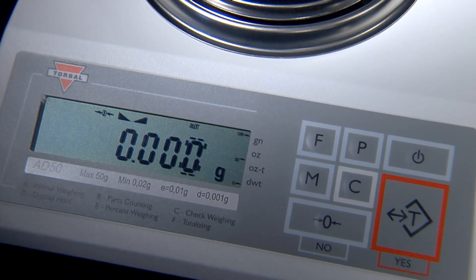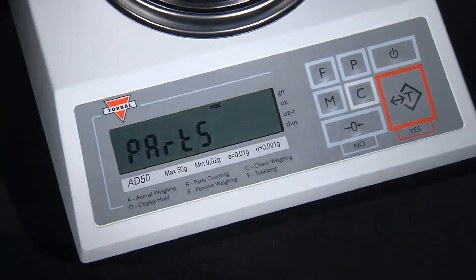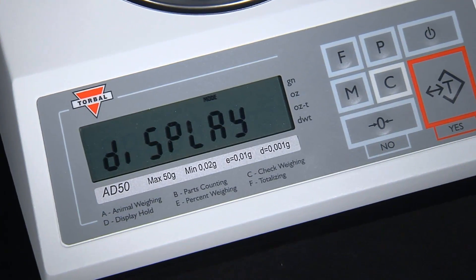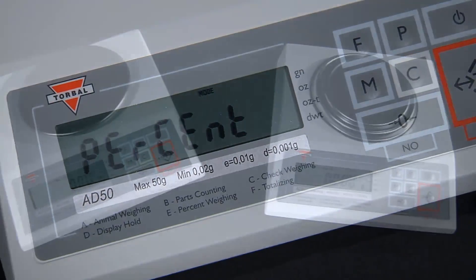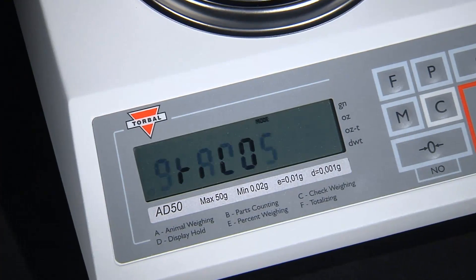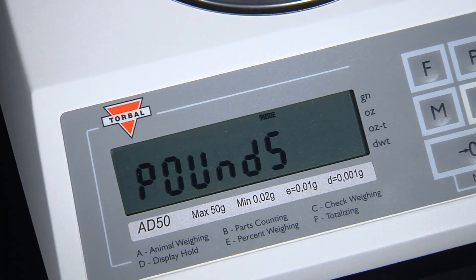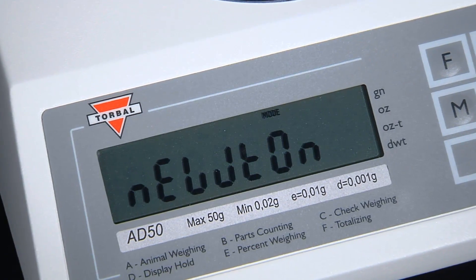Each AD scale incorporates seven application modes such as parts counting, animal and dynamic weighing, percent weighing and totalizing. The scale also weighs in nine different units: grams, kilograms, carats, pounds, newtons, grains, ounces, ounces troy and penny weight.